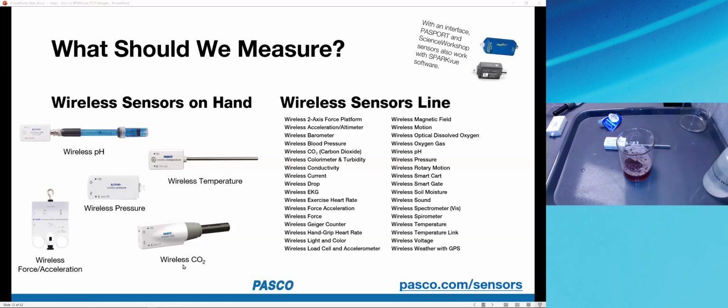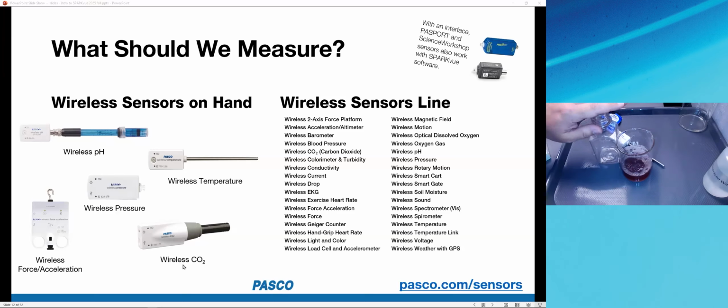Francisco asks, how do we need to put the sensor if we want to measure the pressure increment? Indeed. So it happens that a lot of our sensors come with these 250 milliliter sampling bottles. So we could put the juice inside the sampling bottle, and we could quickly grab the pressure sensor. And before we put the antacid in, we could take something like a one-hole stopper and fit it into this bottle.